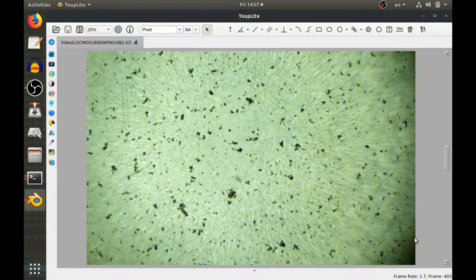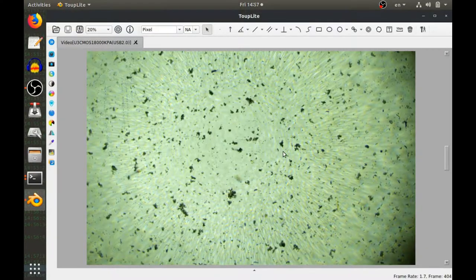I have prepared them here on a slide, and I mount the slide on the microscope to visualize them. Okay, this is the image from the microscope.